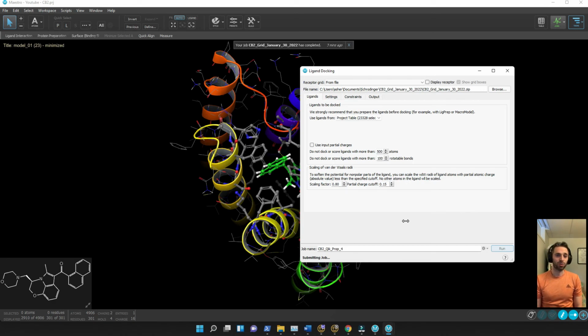Ligand discovery using computers is actually really cool in that you don't have to synthesize all these compounds and run all these through bioassays, which takes way longer than this. I consider being able to model this on a computer a privilege. It's a super cool, efficient way to figure out what compounds are likely to bind versus not bind without having to do all the crazy legwork of synthesizing compounds and running them through functional assays, which takes a super long time.